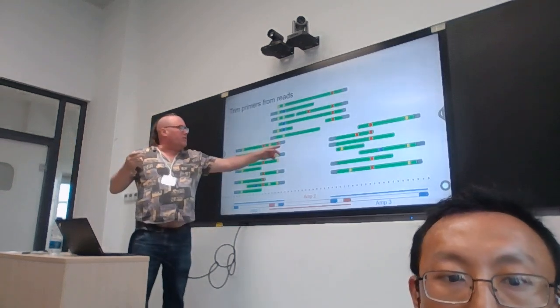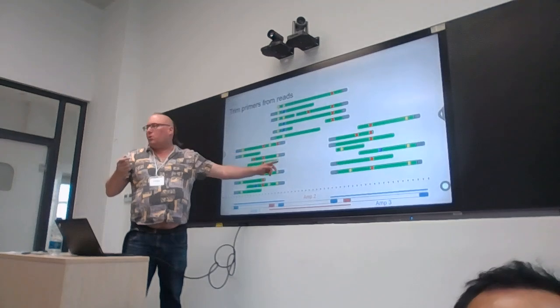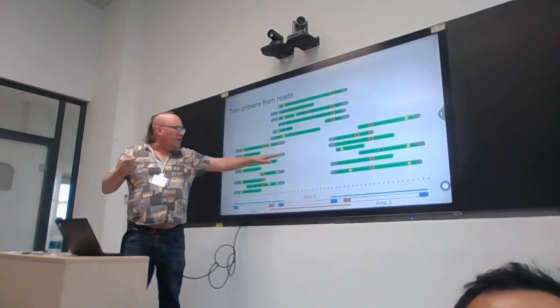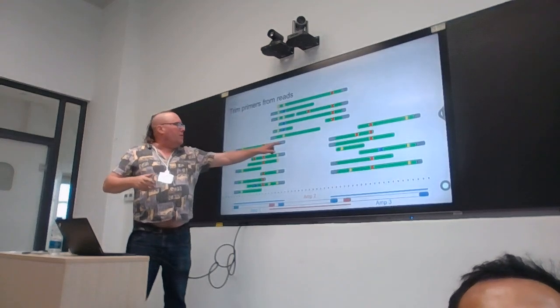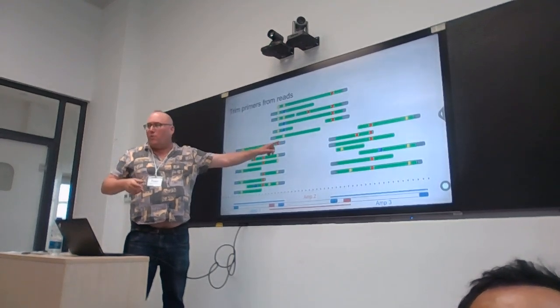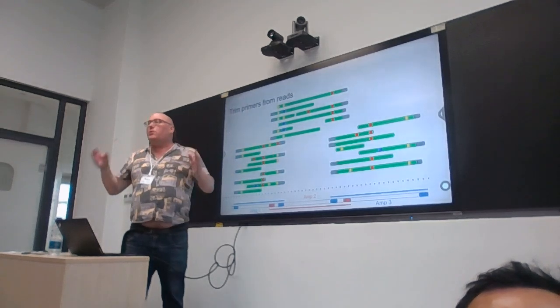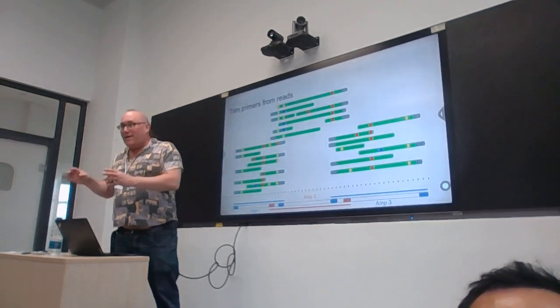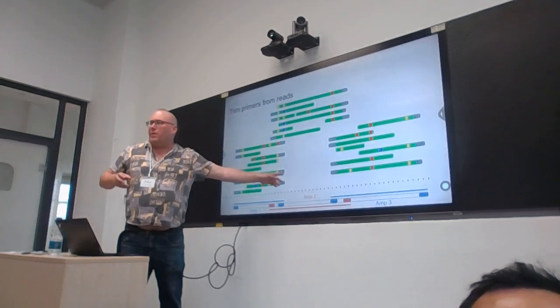Which means that if there's a mutation inside of this section where it's gray, in the primer, then this sequence will not show us the real sequence of the virus. It will show us the sequence of the primers that we put into the PCR reaction. Okay, so that's why we have to remove this piece of the sequence.